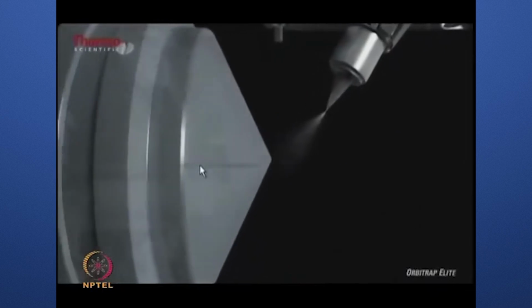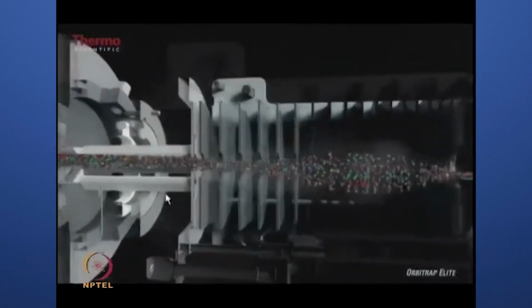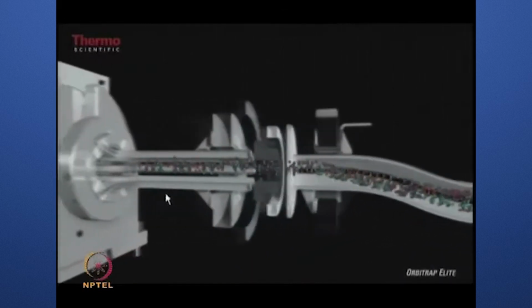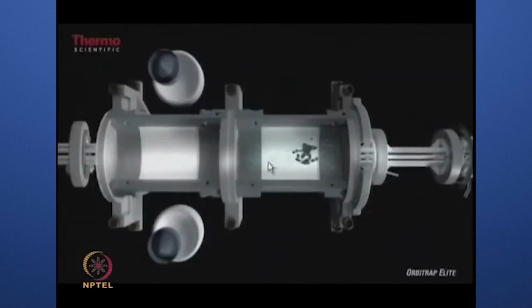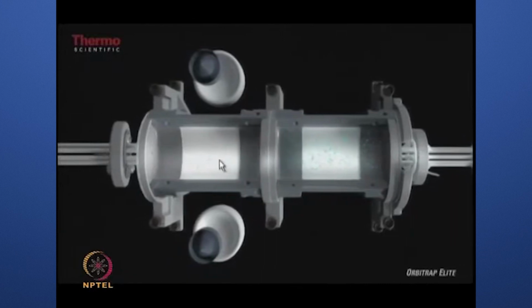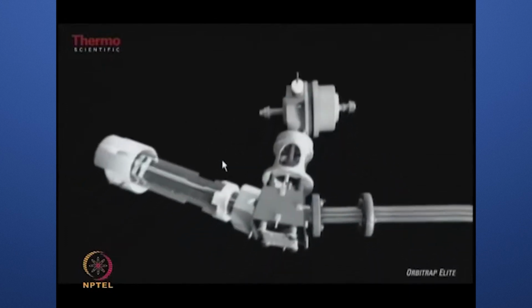So coming back to the ionization source, the ions generated from the source go into the transfer optics. After going out from the transfer optics, they go to the linear trap. In the linear trap, in a full scan mode, the ions are stored in the high pressure cell. Once the ions are stored there, they then go to the C-trap through the ion transfer optics.